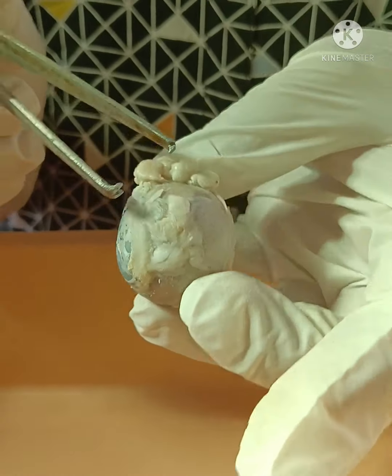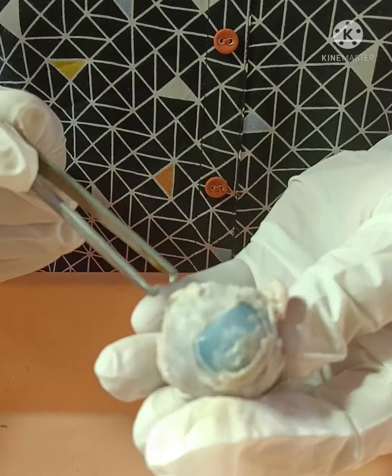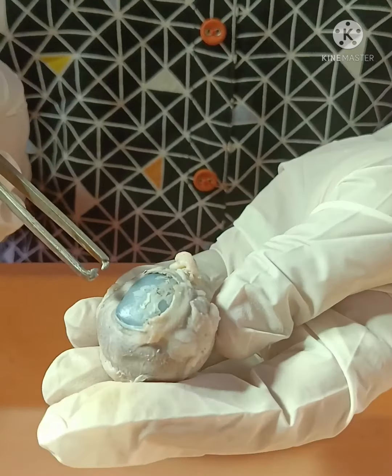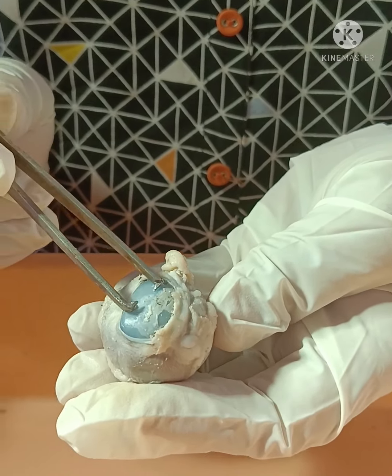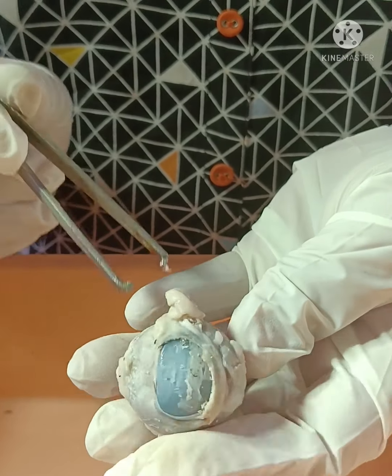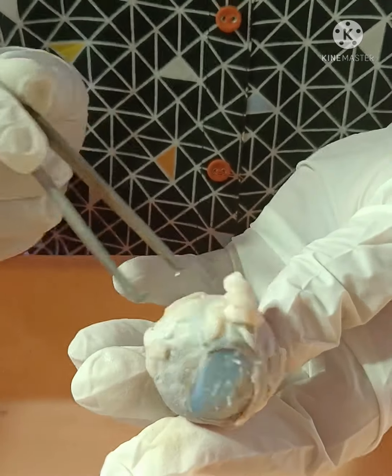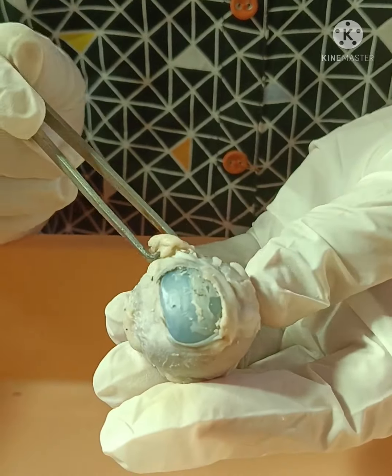In the outer layer, there are two parts: the sclera, which is the white of the eye, and the cornea. The cornea occupies the anterior 1/6 part of the fibrous coat, whereas the sclera occupies the posterior 5/6 portion of the coat.